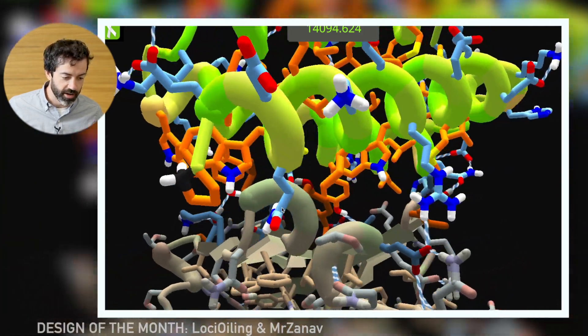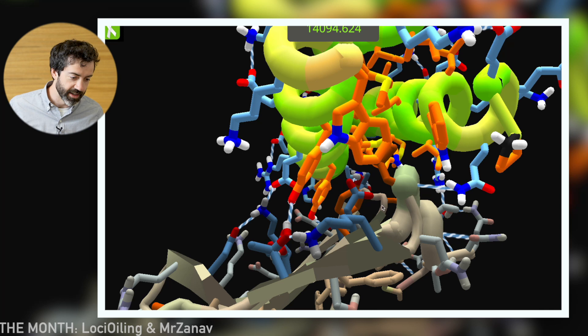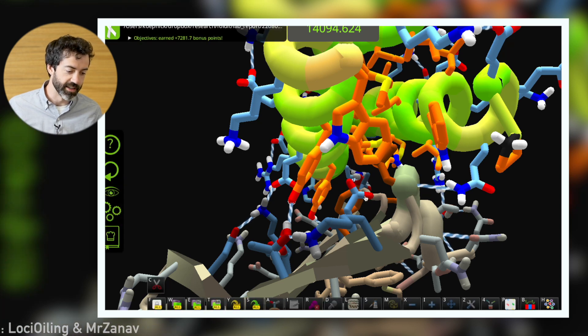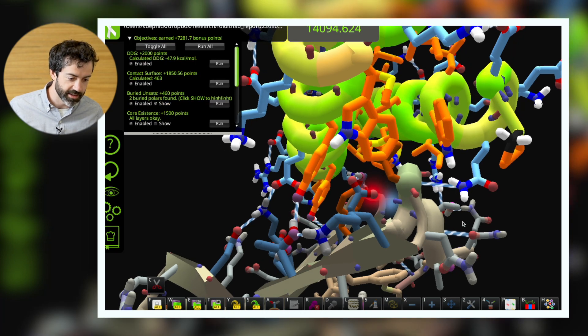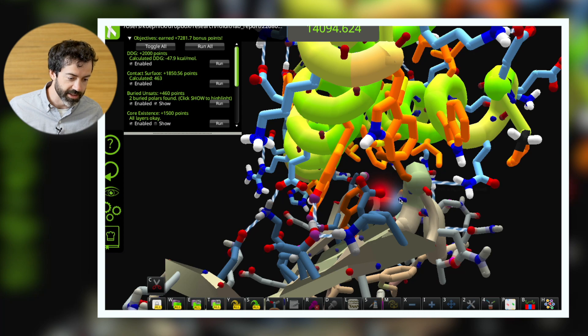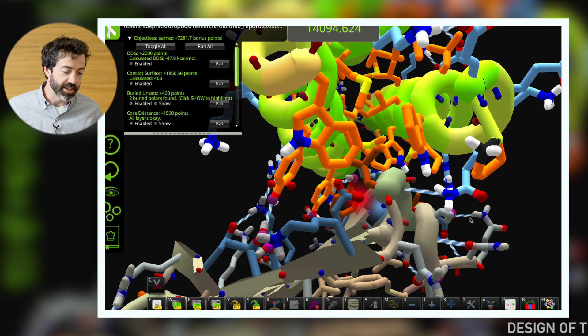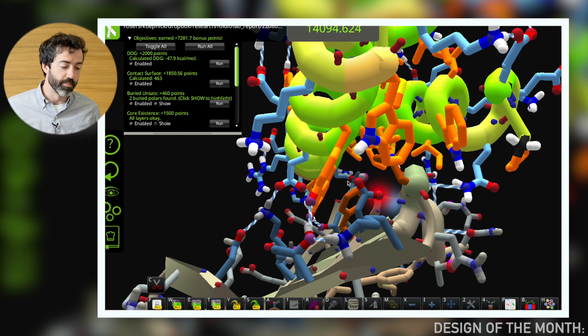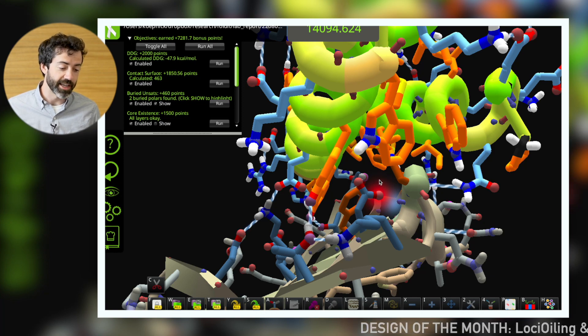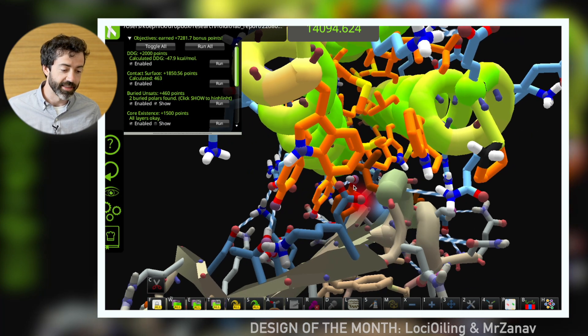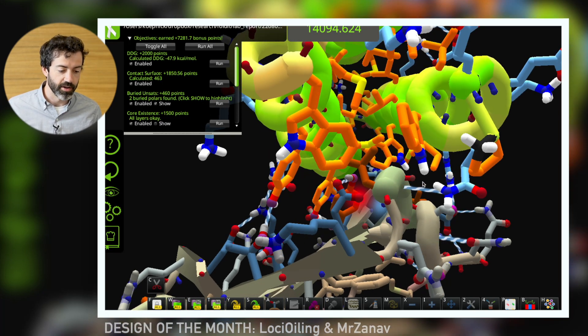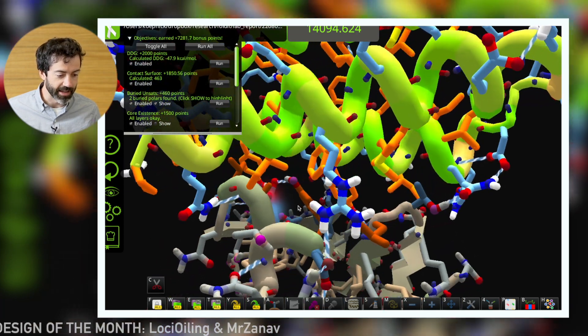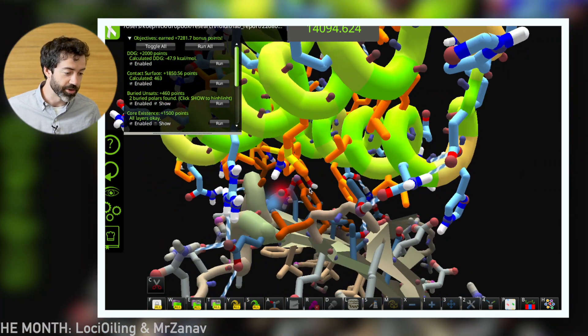There are a couple of polar atoms in the interior of the binding site that I'm a little bit worried about. We can check our buns objective and we see that it does flag a couple of these atoms here. So this is something to be careful of. Whenever we have buns, buried unsatisfied polar atoms at the interface, that can prevent binding. So this could be a little bit worrisome, although there's enough good hydrophobic packing otherwise that it might be able to cancel it out.